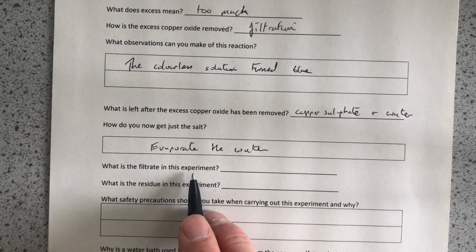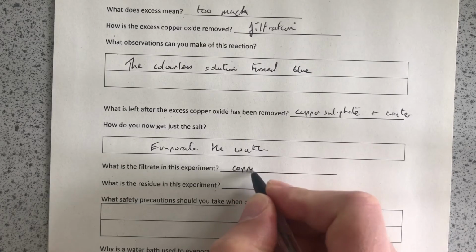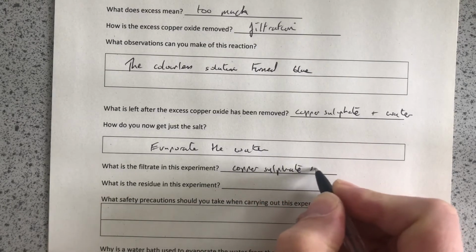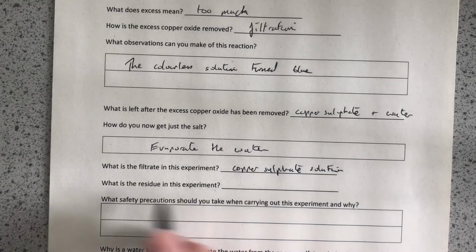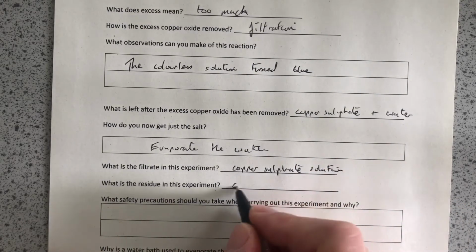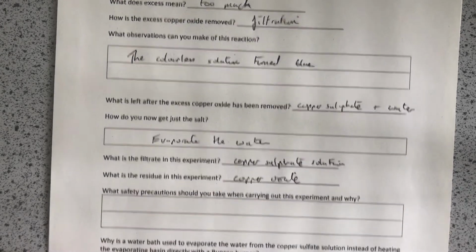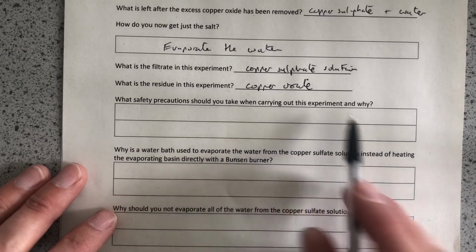What is the filtrate in this experiment? The filtrate is the copper sulfate solution, because the copper sulfate solution goes straight through the filter paper, therefore that's the filtrate. The residue, that's what's left in the filter paper, the copper oxide. What safety precautions should we carry out with this experiment and why?